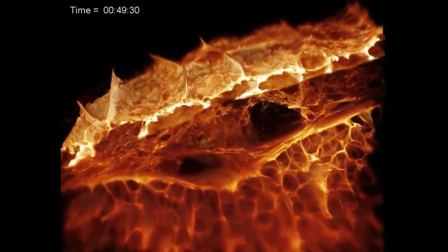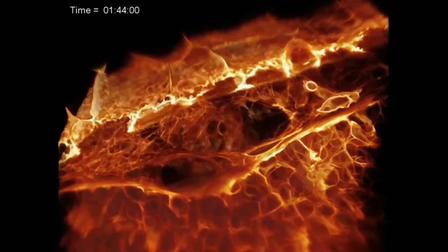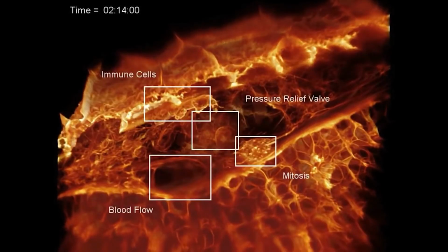You also have to use organisms that you can see through. So zebrafish embryos are what they use a lot because we know a lot about them, but we also can see through them, which makes them convenient. So there are some limitations to it. It's not a perfect technique. But you can see some of the images are really, really stunning.